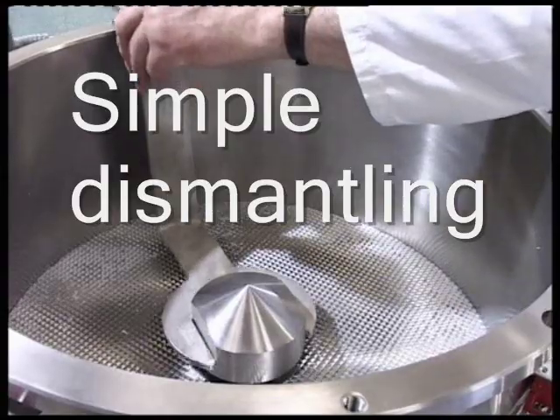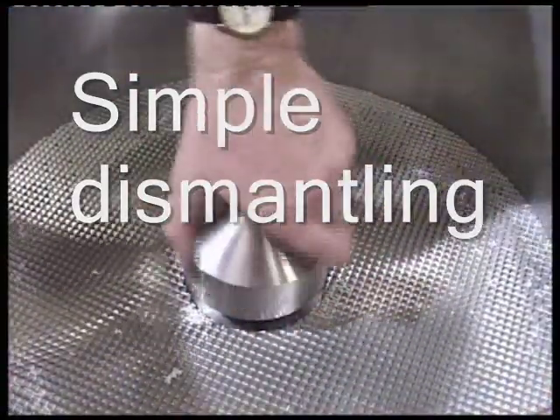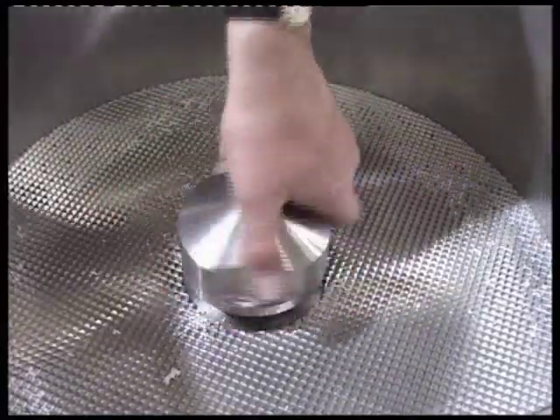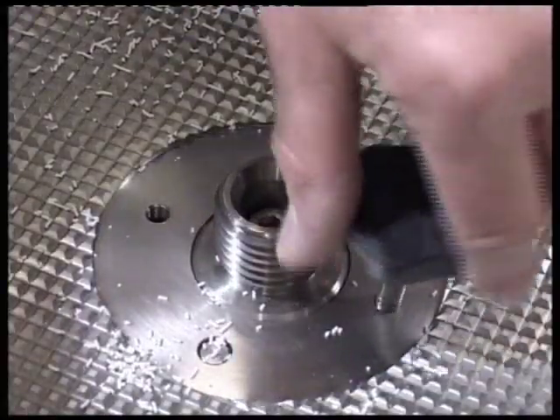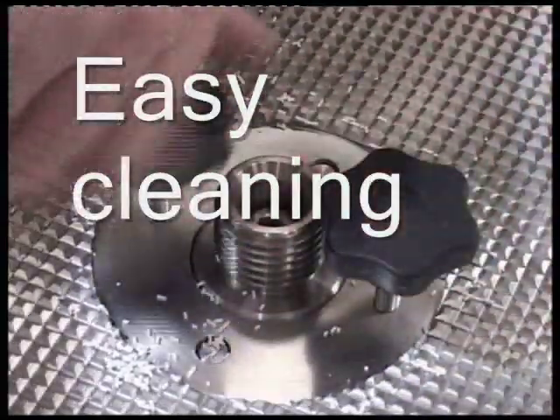Post-production, the machine is very simple to dismantle. The cleaning of the machine is straightforward and easy.